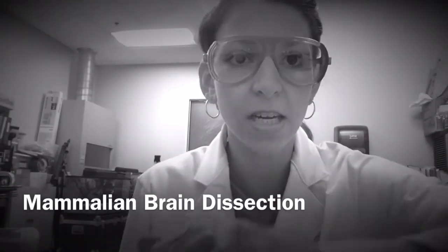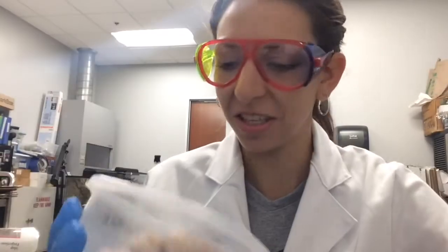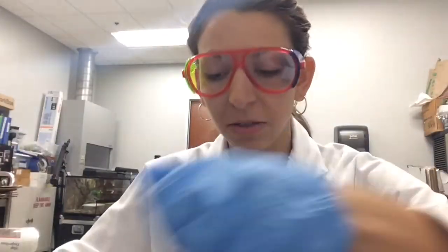Oh, what do I have in here? It's a brain! Okay, so again, I'm not a zombie, but today we're going to be working on our mammalian brain dissection. So brains are really cool, and there'll be a whole other video where we'll talk more about the structure and function of different parts of the brain, but today we're just going to review the dissection.